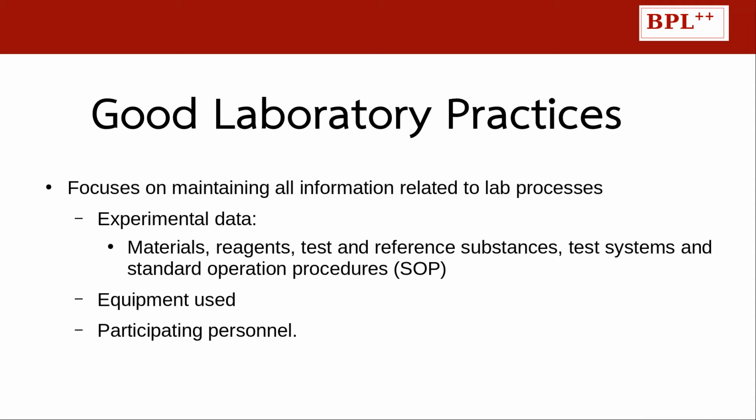GLP compliance facilitates the acceptance of data at both national and international levels in the context of regulatory processes, where authorities must assess the safety of new products. It focuses on maintaining all information related to laboratory processes, such as materials, reagents, test and reference substances, test systems, and standard operation procedures. It also maintains information on the equipment used and participating personnel.